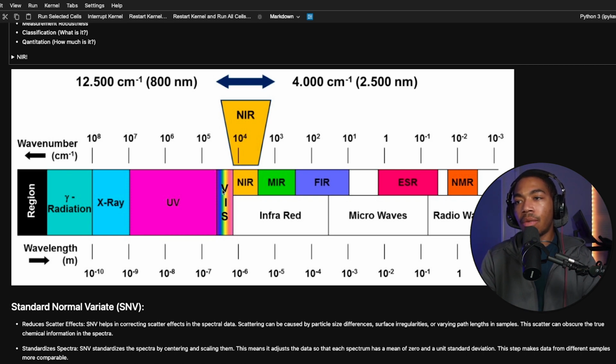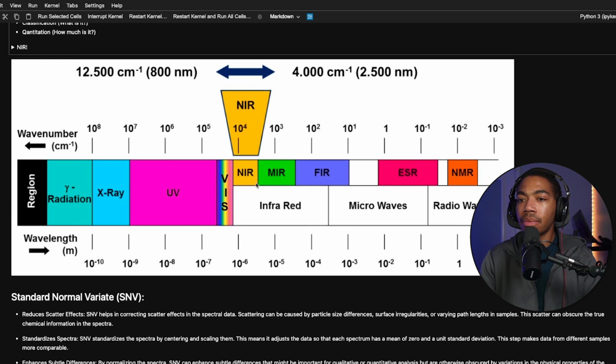So infrared, red side, ultraviolet on the blue-violet side of the visible spectrum. And so based on this, we can infer the types of energy we're talking about. So now we're talking vibrational, rotational type energies, and what we're able to then monitor as it relates to the patterns available to us when we look at these drug tablets, these powders, these excipients, and adulterants.